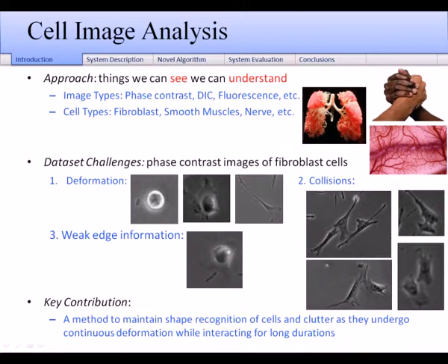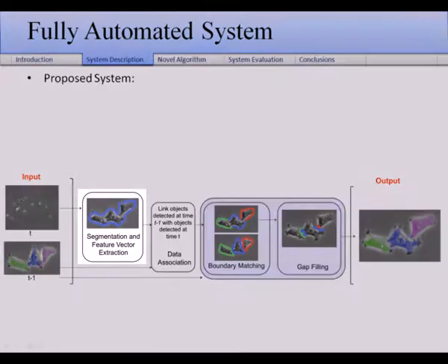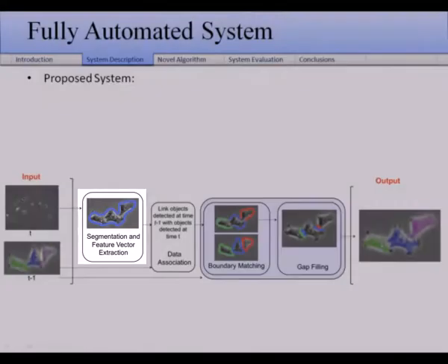The focus of our work is on maintaining shape recognition as cells interact with other cells. We developed a fully automated system that addresses the challenges of our dataset and obtains accurate cell segmentations. The first module finds and characterizes the contour of all cell candidates in the current image.